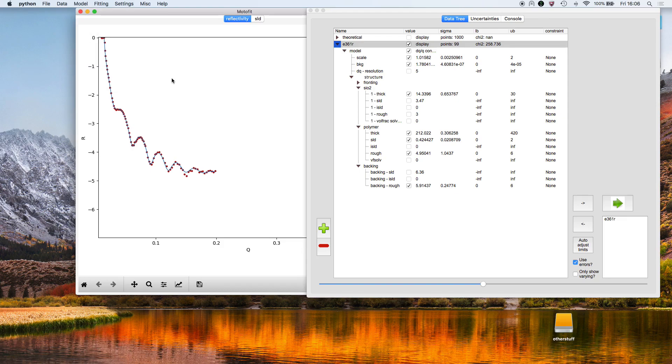That's basically a quick demonstration of how to fit data, the simplest kind of thing that you could fit.